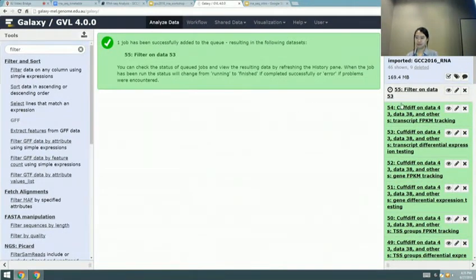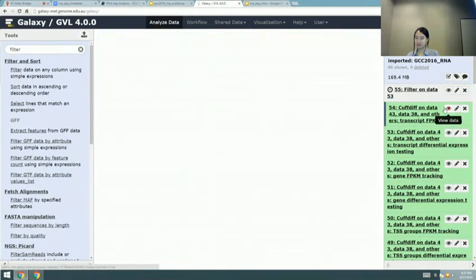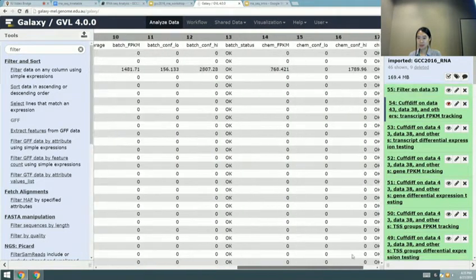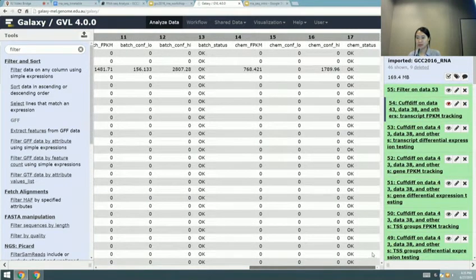That's how you get real power. There's been experiments where people have done 40 replicates, and they've detected genes, and then they've removed replicates one at a time and done the analysis to see what happens as you go down to 3. And the difference is staggering. 3 barely even touches the surface. It finds all the really obvious differences, but once you get to 20, 40 replicates, you can start to detect very subtle differences. So if you want to really detect subtle differences, you have to do 40 replicates. It's expensive, right? 3 replicates will only find gross, quite large changes that are potentially obvious.